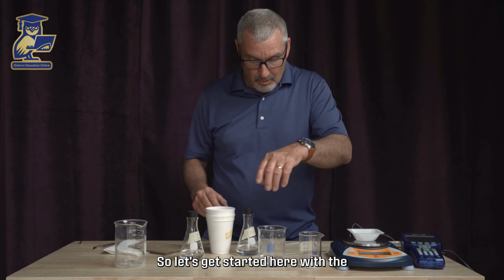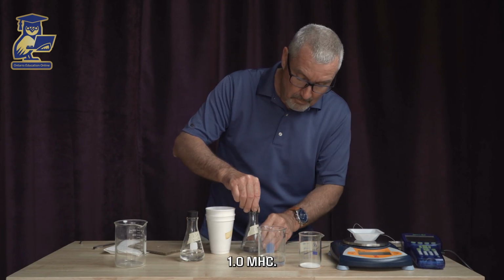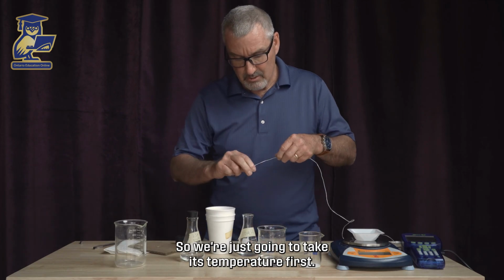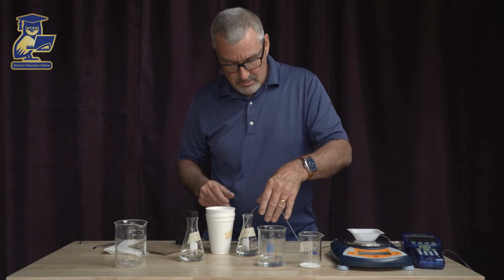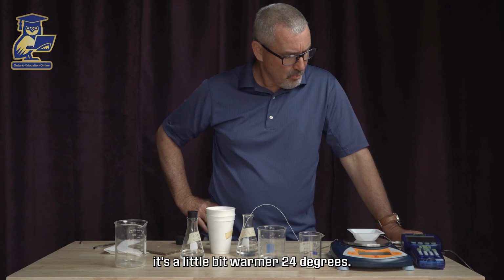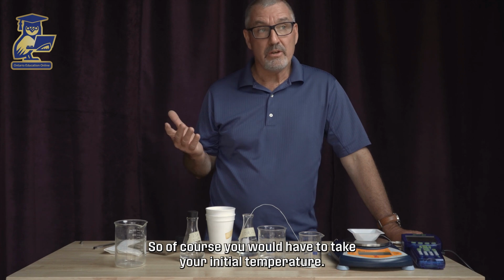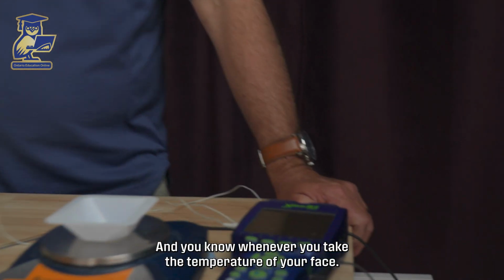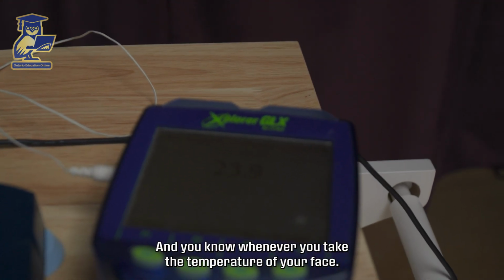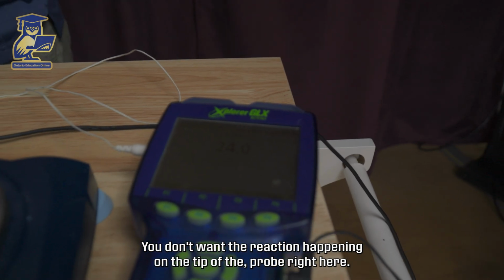All right, so let's get started here with the 1.0 M HCl. We're just going to take its temperature first. So we put this in here, and it's a little bit warmer, 24 degrees. So of course you would have to take your initial temperature, and whenever you take the temperature of your base, now make sure you wipe this off. You don't want the reaction happening on the tip of the probe right here.